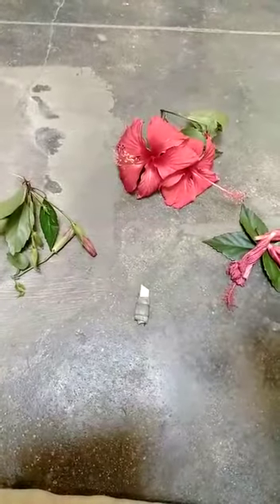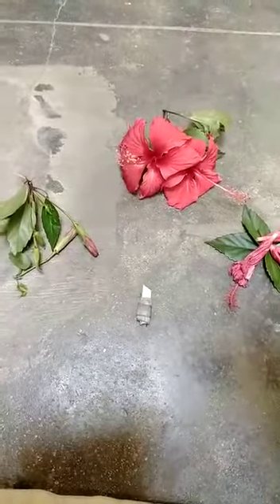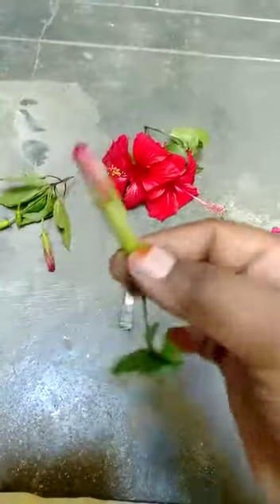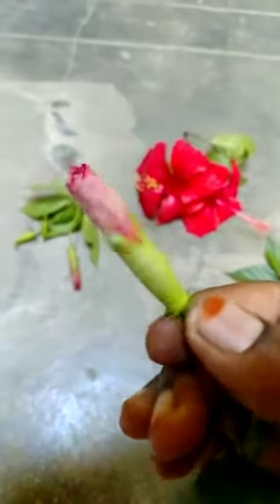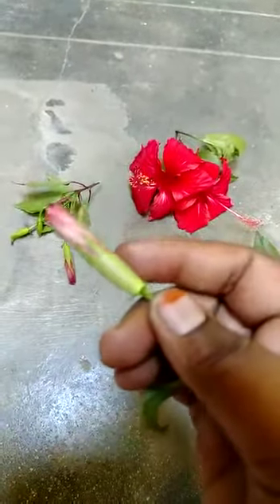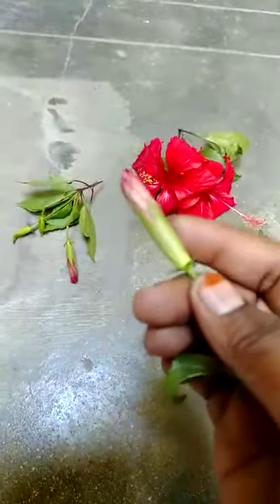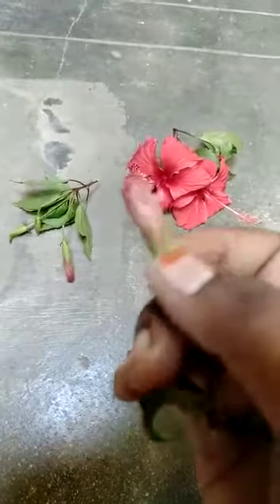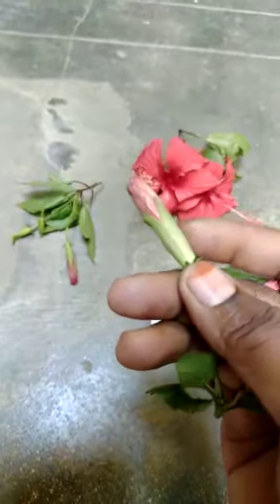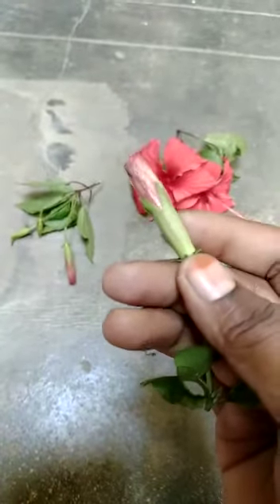Before we enter into the dissection experiment, I want to tell you about the parts of this hibiscus. See, this is a bud of a hibiscus flower. It has not yet bloomed, and the greener part which is holding the petals is called sepals. The other name for sepals is calyx, and this is the leaf of the hibiscus flower.